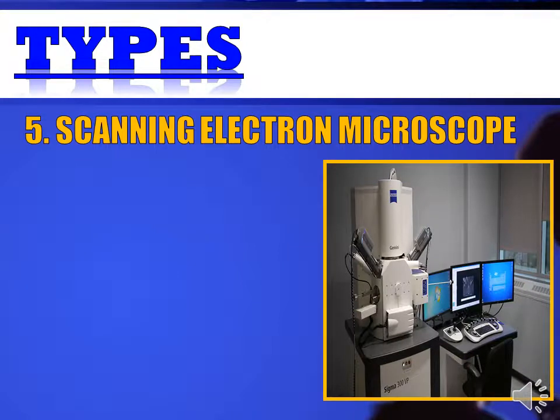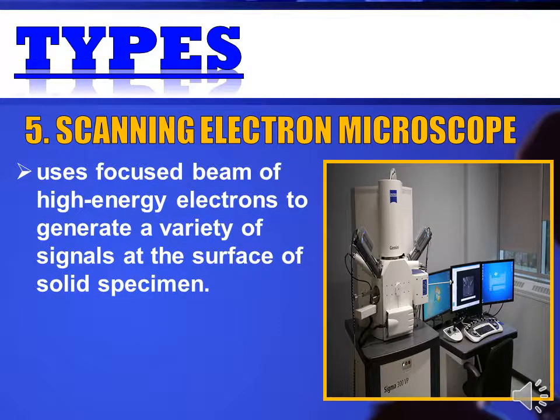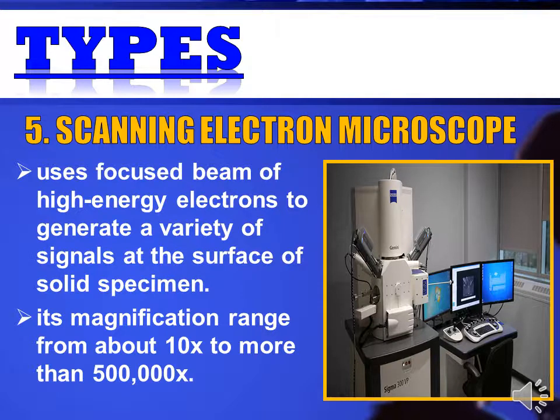This is scanning electron microscope, which uses focused beam of high-energy electrons to generate a variety of signals at the surface of solid specimen. Its magnification ranges from about 10 times to more than 500,000 times. This is the most powerful microscope to date.